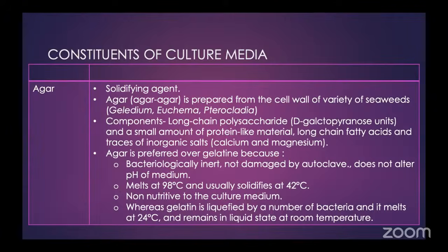Its properties are that it is bacteriologically inert. It doesn't get damaged by autoclave. It doesn't break down by autoclave. And it does not alter the pH of the medium because nothing is getting metabolized, so the pH doesn't alter. The best part is that it melts at 98 degrees and solidifies at 42. So it's a different temperature. It's giving you a very broad range. And it is completely non-nutritive.